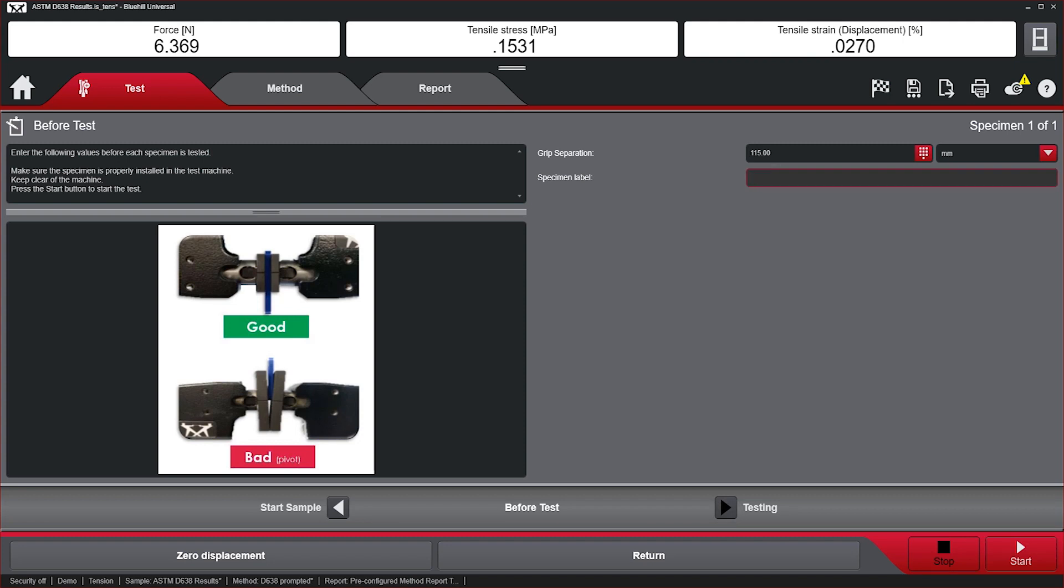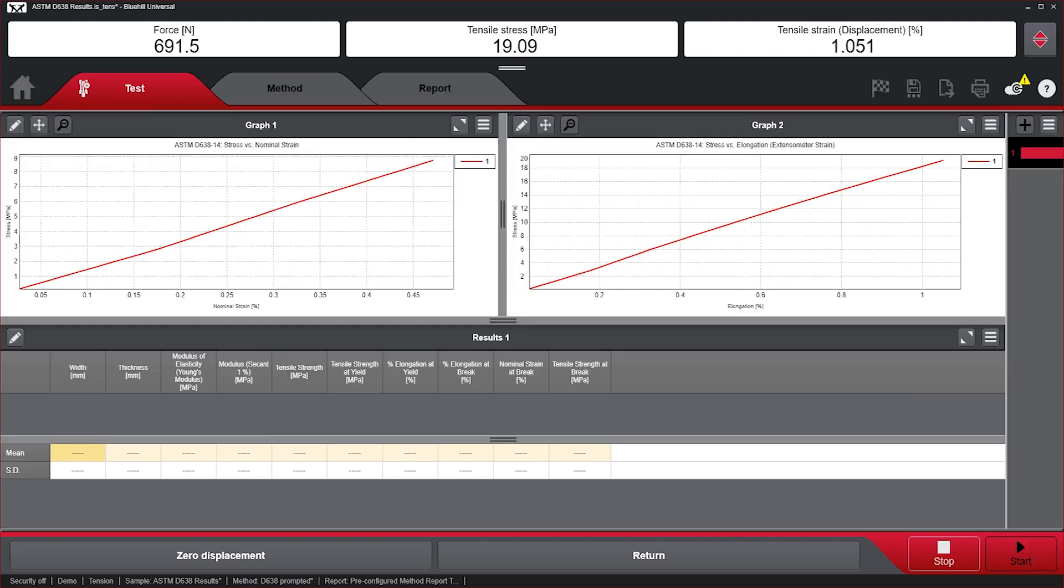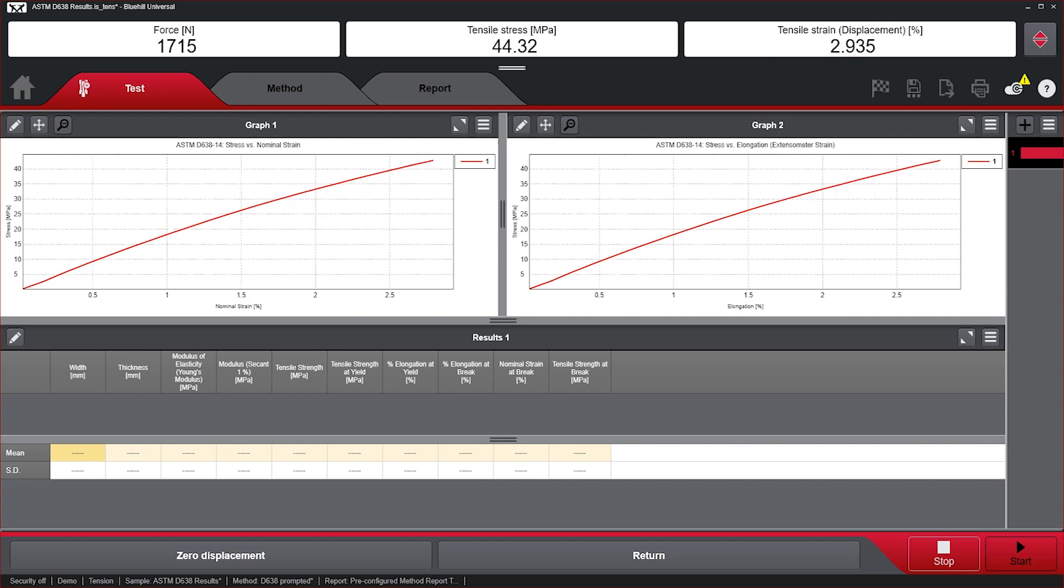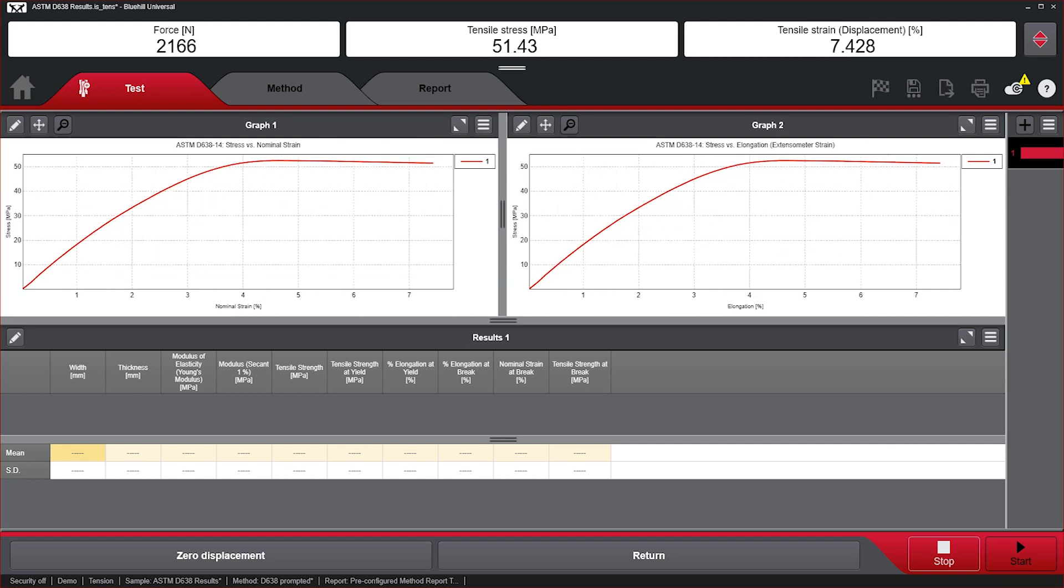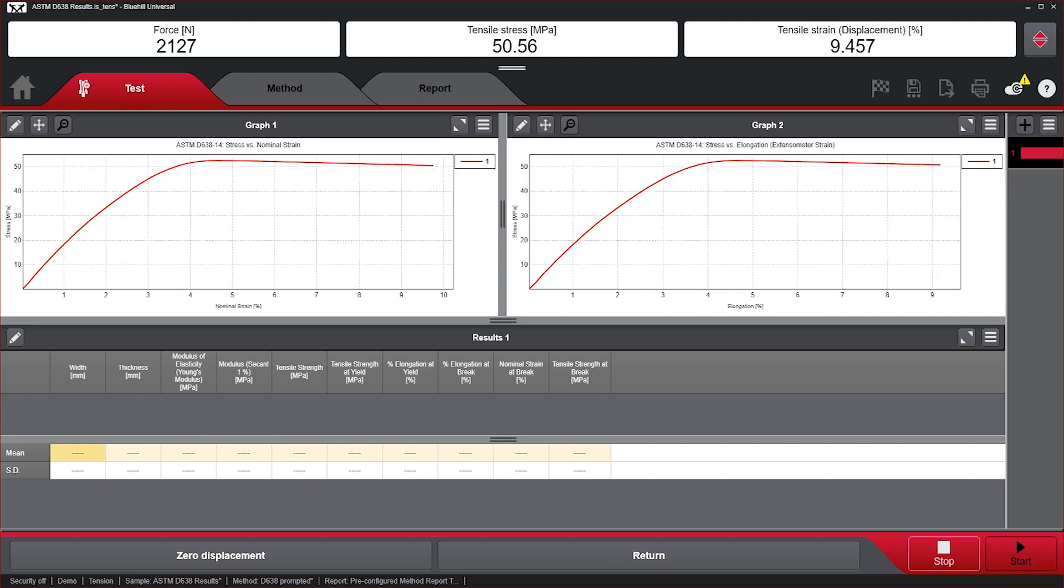Prompted test is ideal for quality control professionals who are responsible for collecting accurate and reproducible data and results.